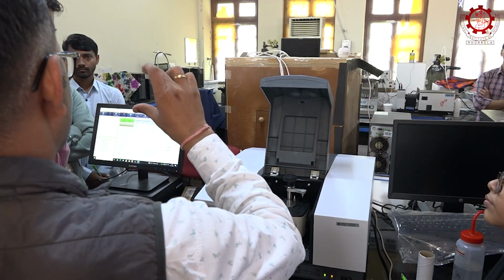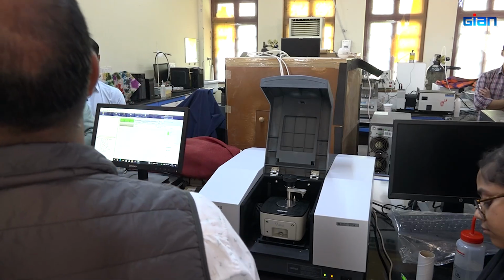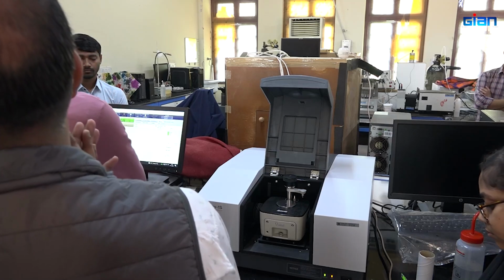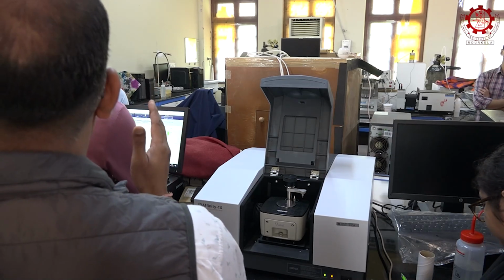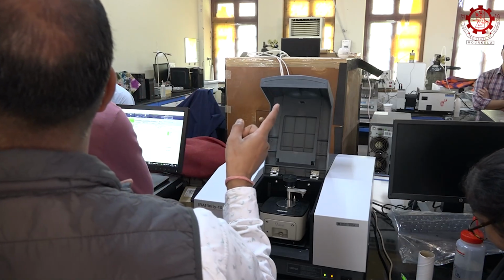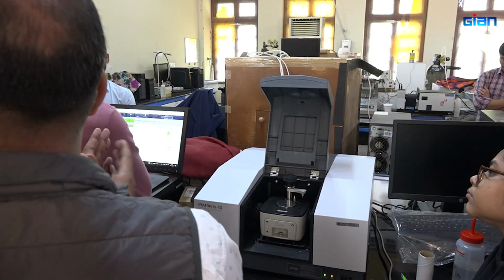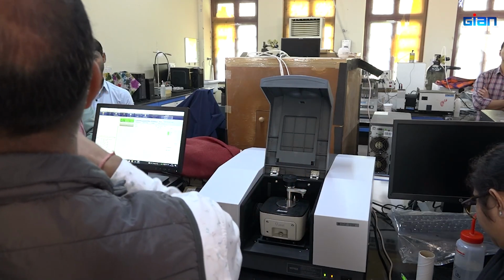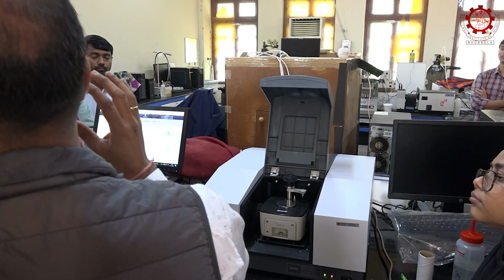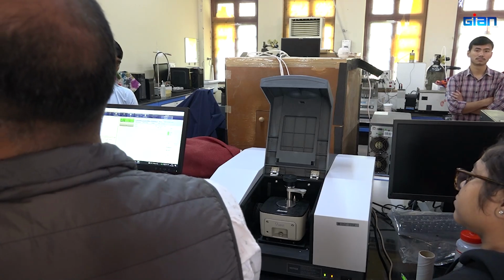And to avoid that carbon dioxide, what we always do, we do the absorption of sample and one background. Background means there you don't have your sample. That means the carbon dioxide or any air that will be absorbing the IR radiation in the blank. And what we do, we take our sample and deduct that absorption by carbon dioxide from the blank. Are you getting? So then whatever information we get, that is because of only our sample.